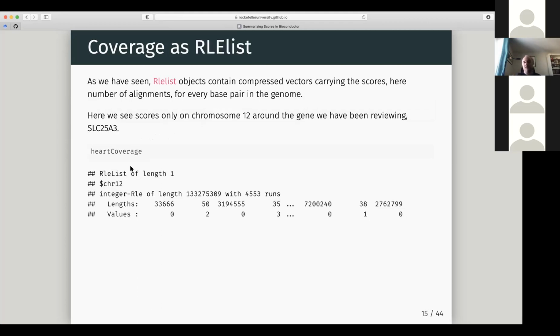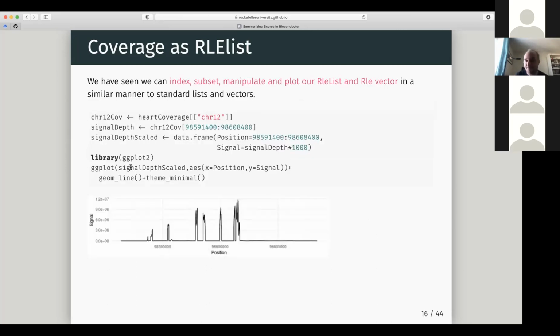We know now that we can export this if we wanted to things like bigwigs and then visualize these in IGV. So already we don't have to visualize the BAM anymore. We saved ourselves a lot of time and memory.